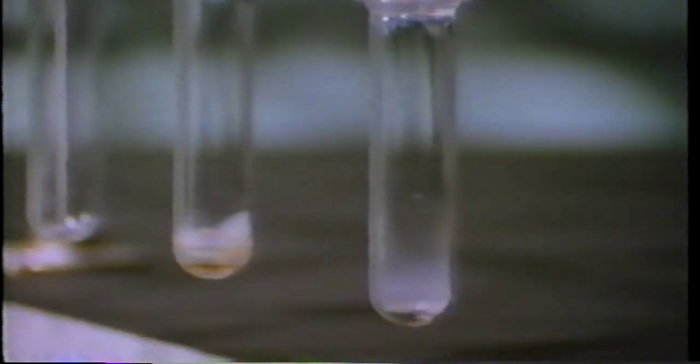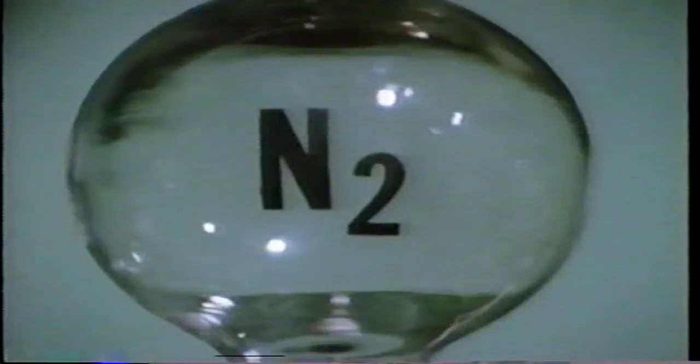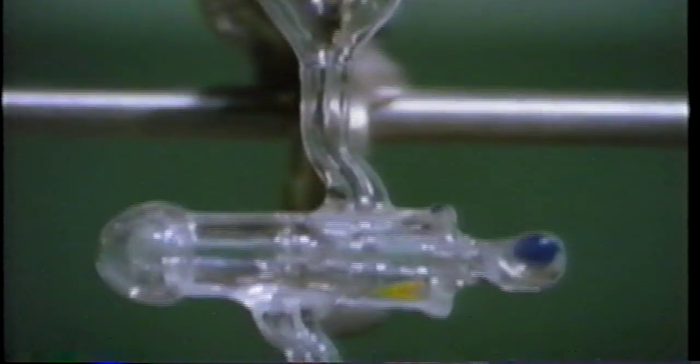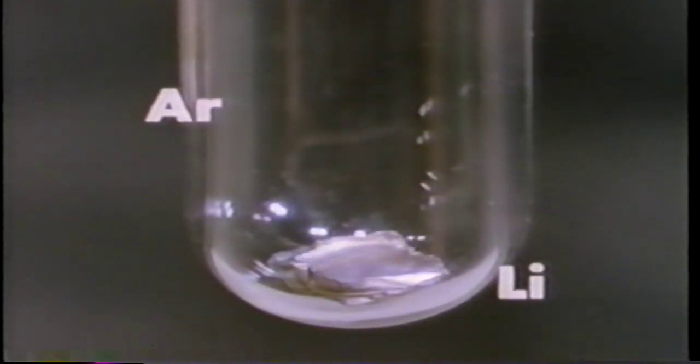You may remember something in air reacted with freshly cut lithium. Let's try the previously inert gases with lithium. Nitrogen was inert toward potassium. Look at the darkening area. Nitrogen does react with lithium. Nitrogen is not inert. Here are argon and lithium. The lithium melts, but argon does not react.